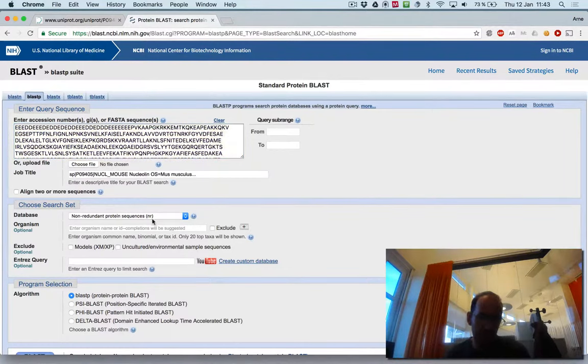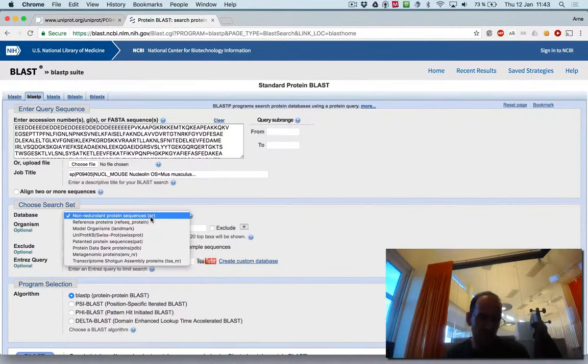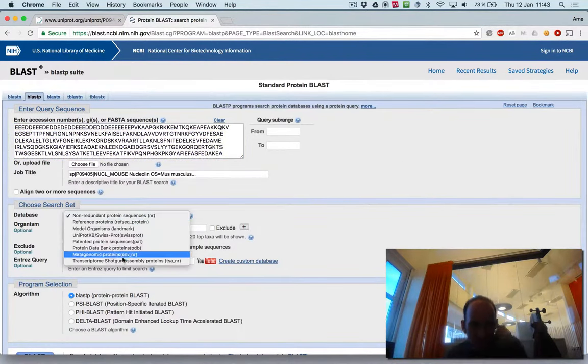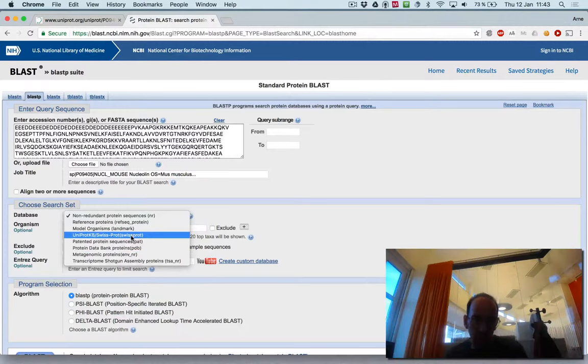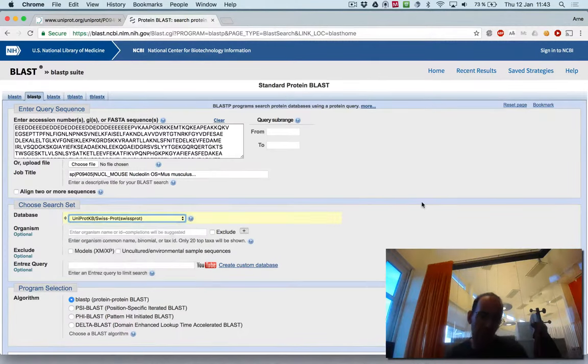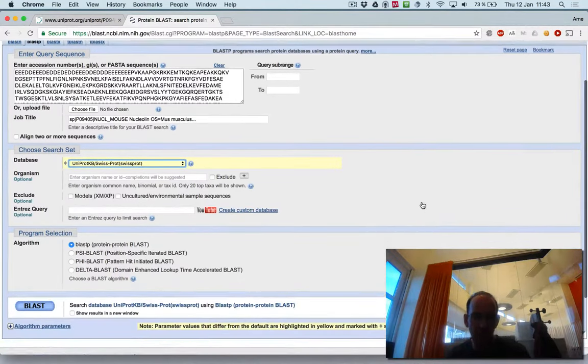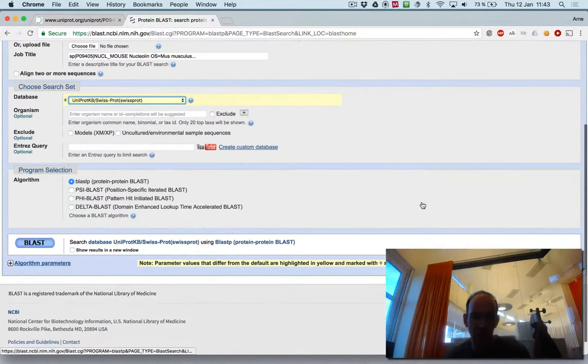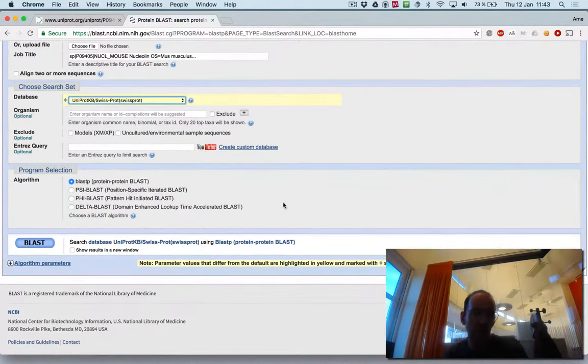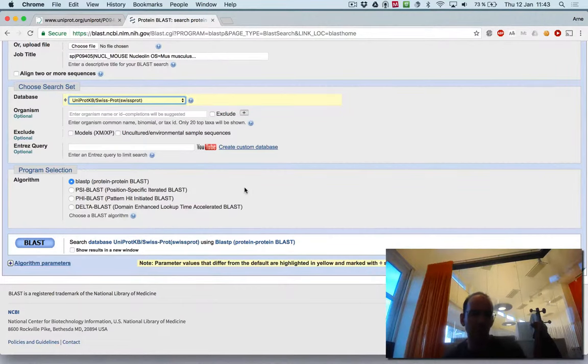You choose your database. If you want to do it a little bit fast, you actually use only SWISS-PROT, so that's much faster, so that's good for running here. In this case, you only use standard BLAST.